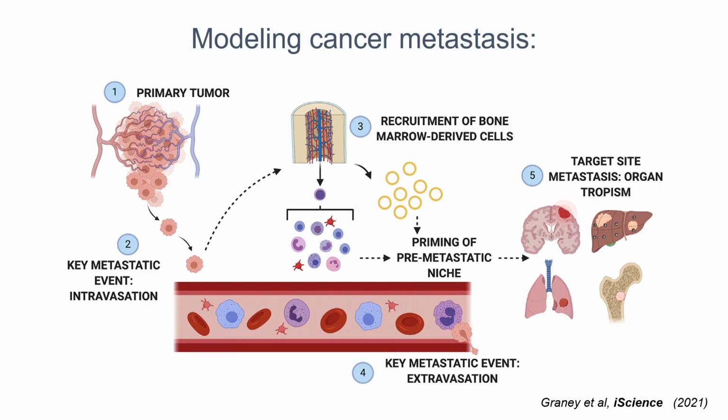So now I'll tell you in a little bit more detail about a model that we've been developing over the last few years, which is the cancer metastasis, like a cancer patient on a chip type of situation, where we are trying to model some of the key events in spreading of the primary tumor cells into the metastatic sites in the body. So the cells need to shed from the primary tumor.